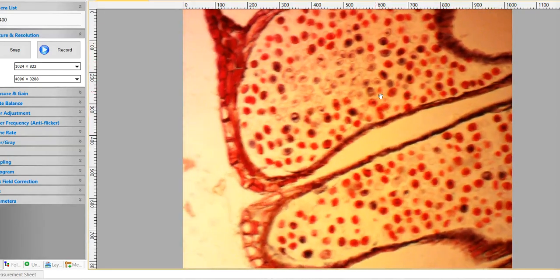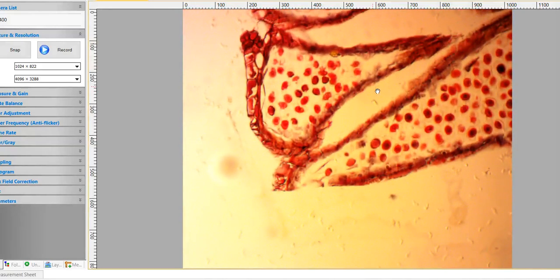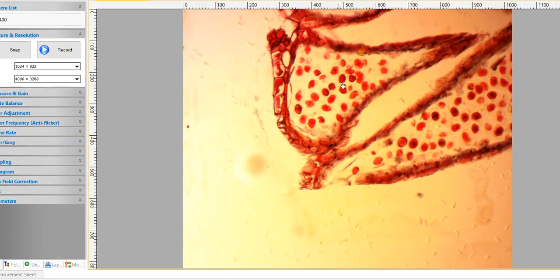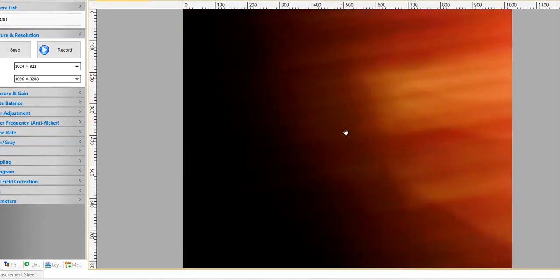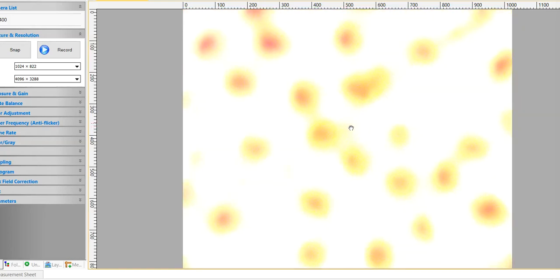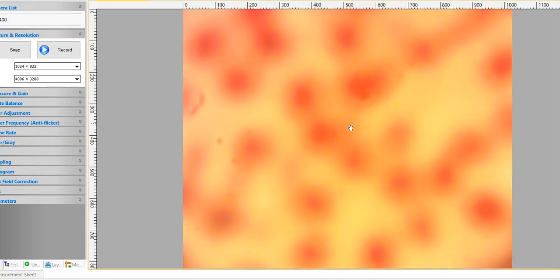Sometimes a slide holder, I think it was down here. Oh, here. There's an interesting one. Let's get that about the center. Oops. Oh, here. We'll go right here. Okay, so then we're going to go to high power. Again, it'll look like it's going to hit the slide, but if you're in focus, there we go. Okay, so now let's bring her into focus.